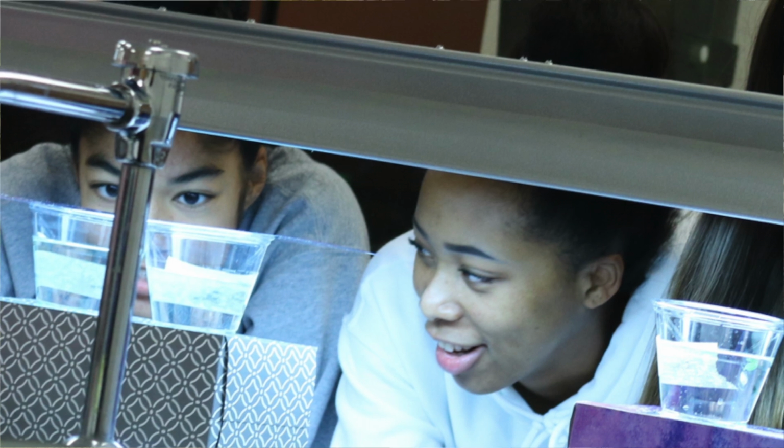And then that way the leaf discs, once they're put back into the cup with the solution, will not stay afloat. They will drop because that decreases their buoyancy. And so the students have to make sure all the leaf discs that they use in their experiment have gone through this process. And so once they've done that, then they can explore whatever variable that they choose.